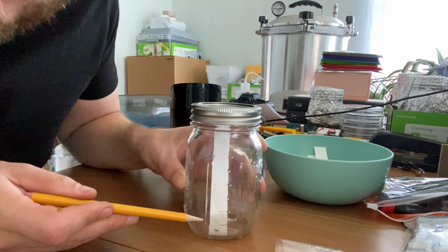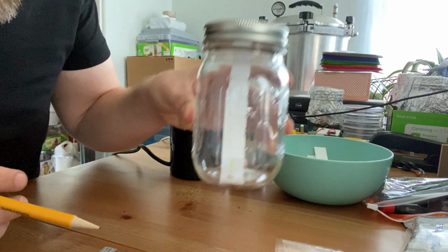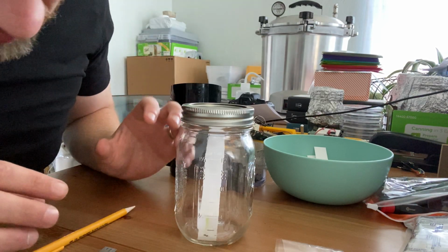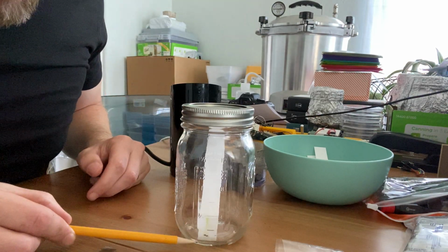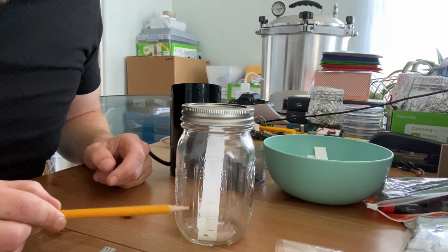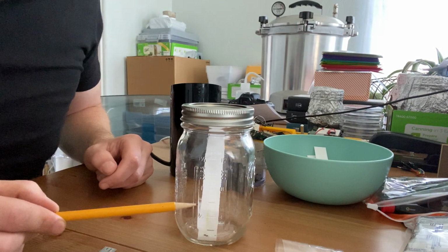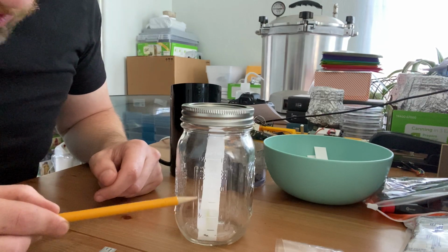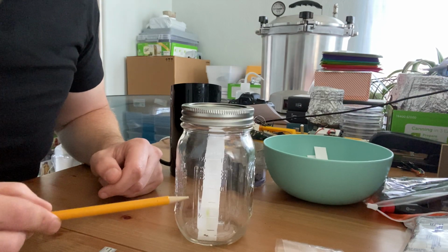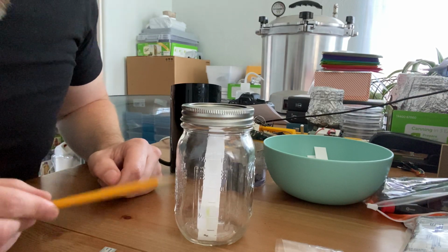In fact, if you look very closely, you can already start to see some green there. I'm going to set it down because I want to make sure that I don't tilt it such that the acetone covers up the sample, because that really will impede its ability to work properly. But notice the solvent front continues to rise. And what we're going to do is wait for the solvent front to stop. So once it stops, we can take this paper out and get a better look at the different compounds that have been separated out.